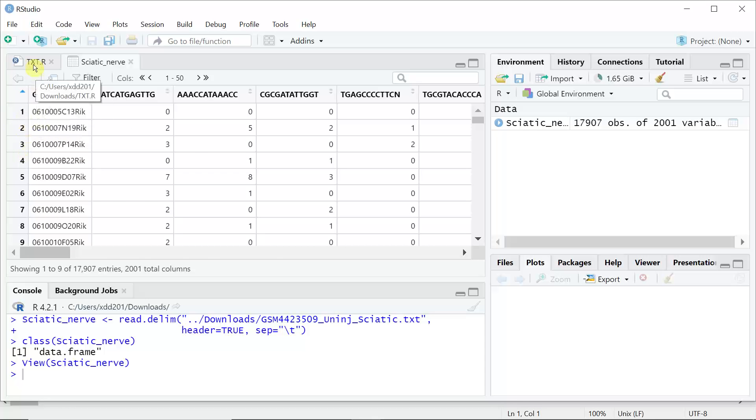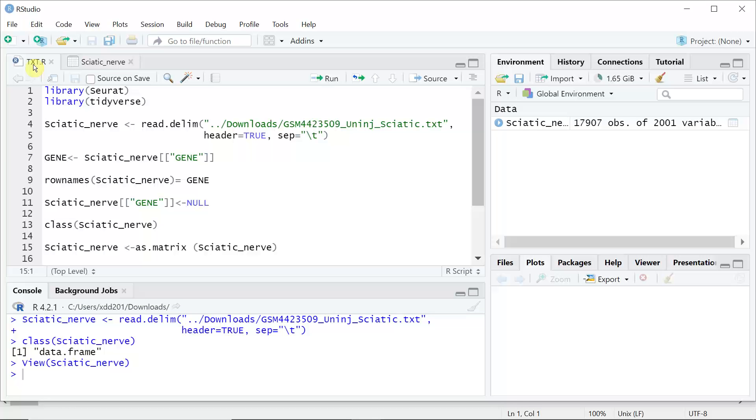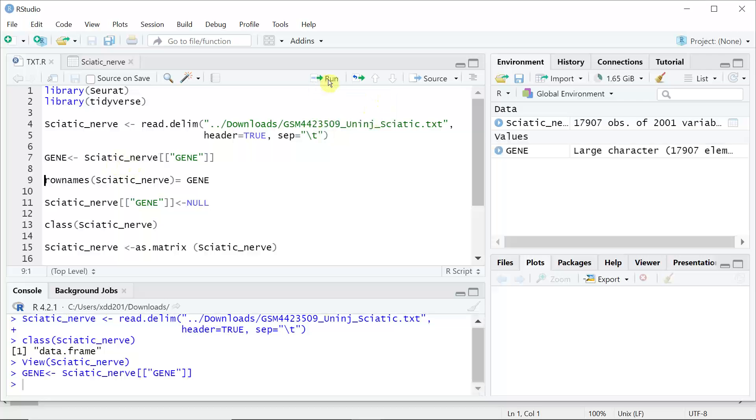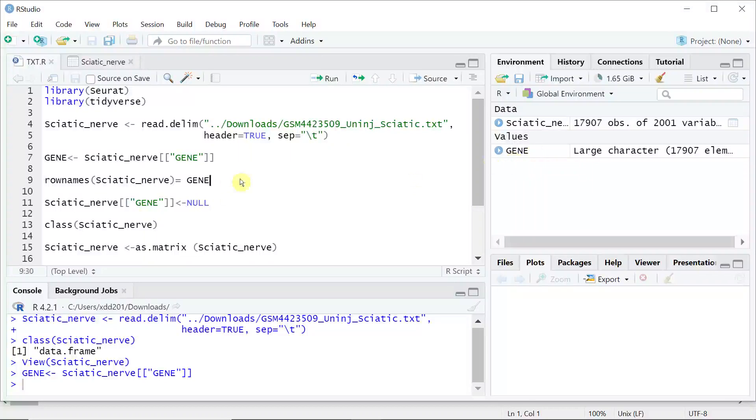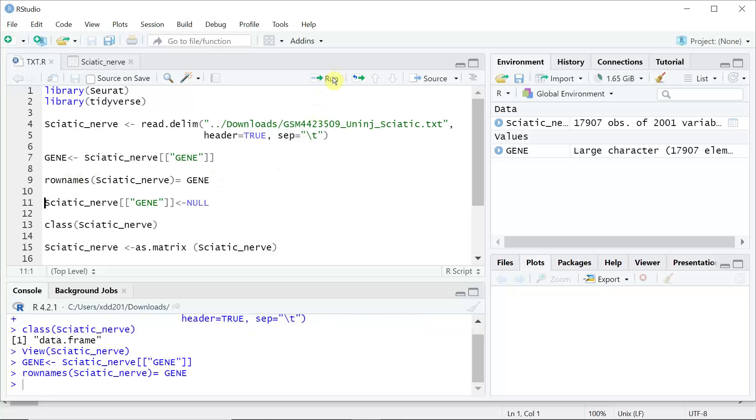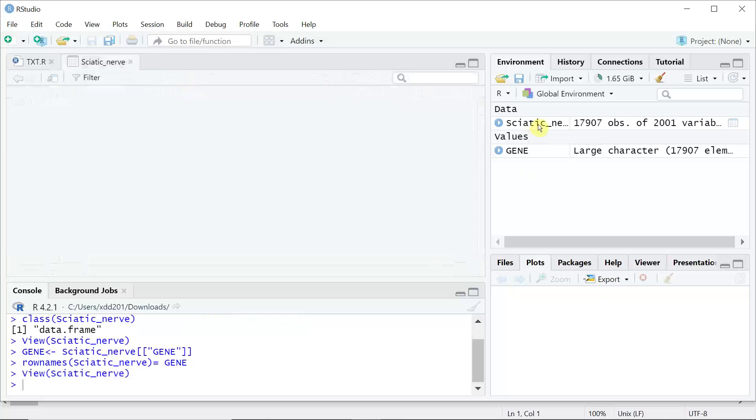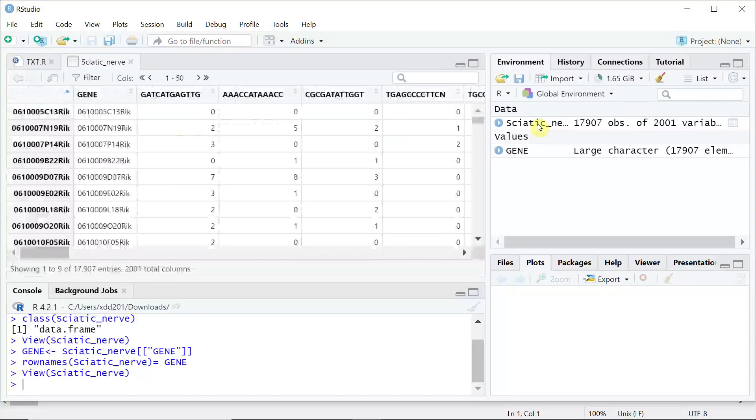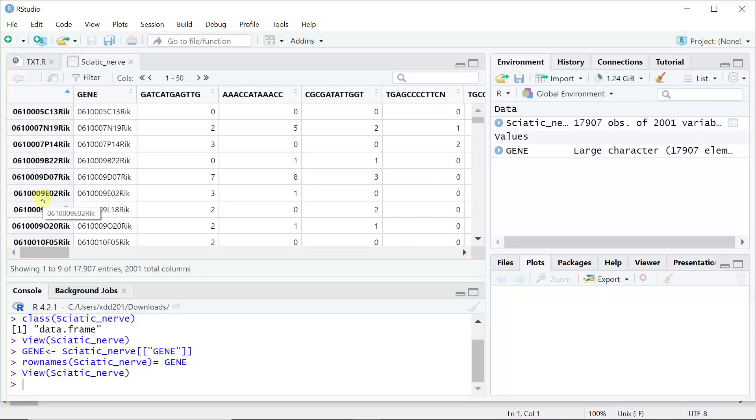We need to make some changes. We can get the gene information from the data frame, name the gene, then we can assign the genes to the row names. Let's run. Now we can have a look at the data frame again. You can see now the row names are gene names.